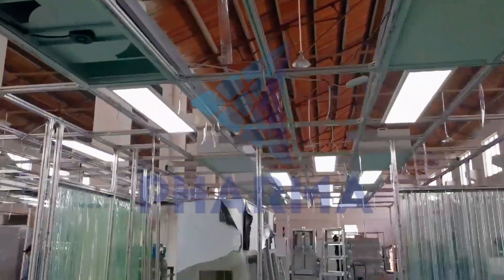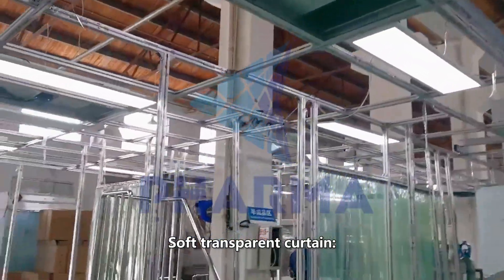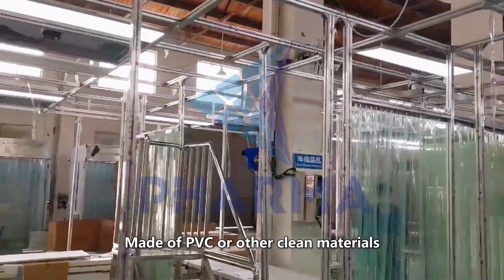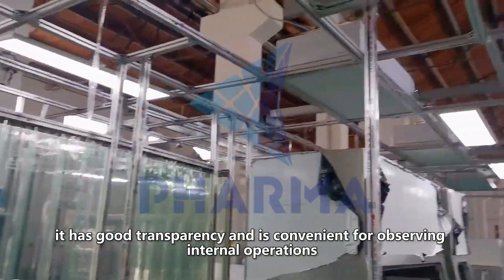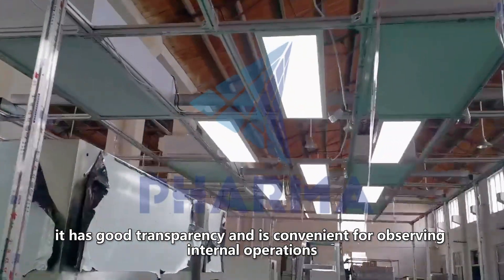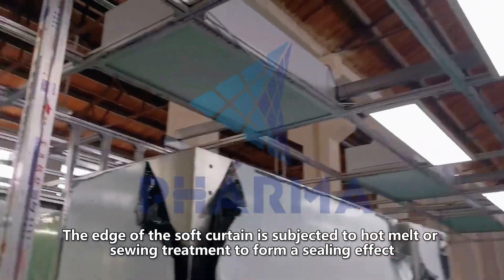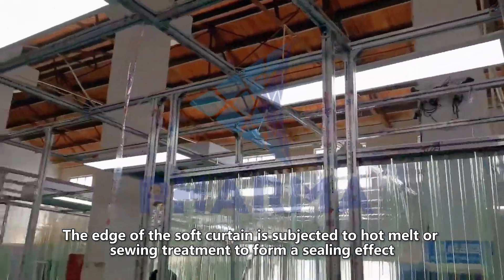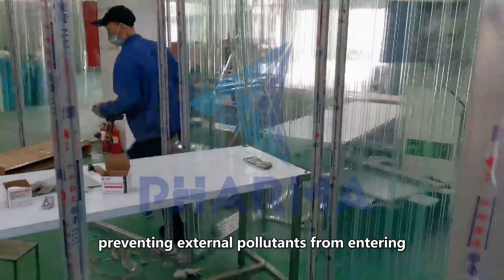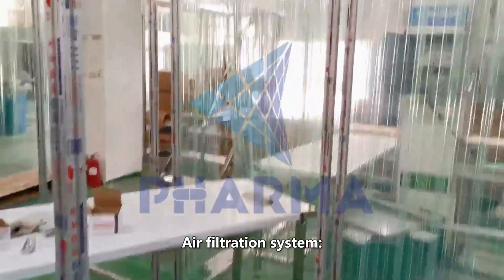The soft transparent curtain is made of PVC or other clean materials. It has good transparency and is convenient for observing internal operations. The edge of the soft curtain is subjected to hot melt or sewing treatment to form a sealing effect, preventing external pollutants from entering.